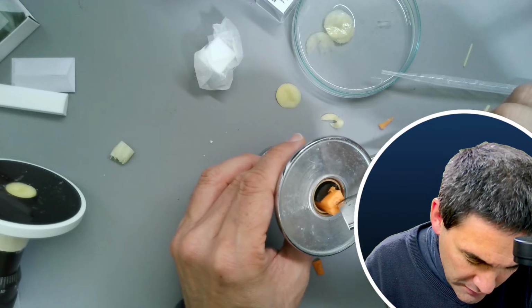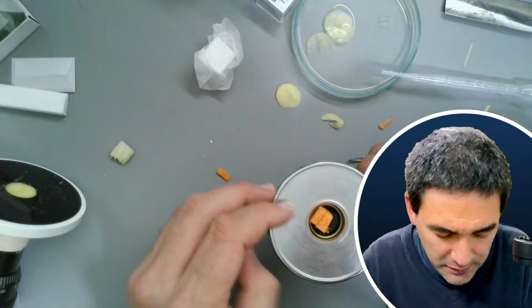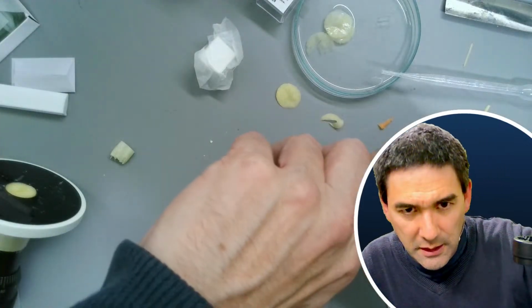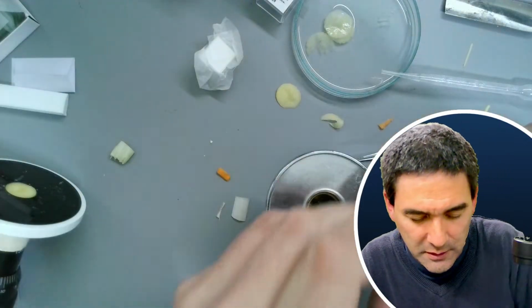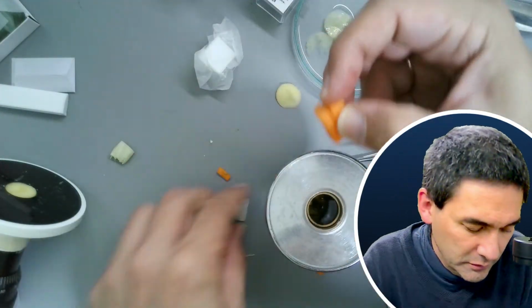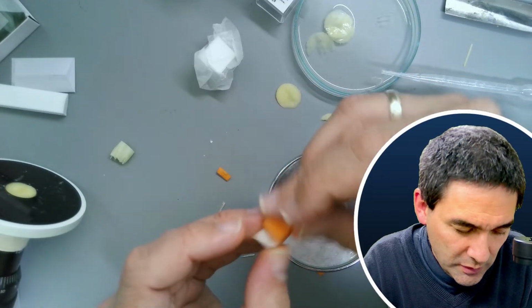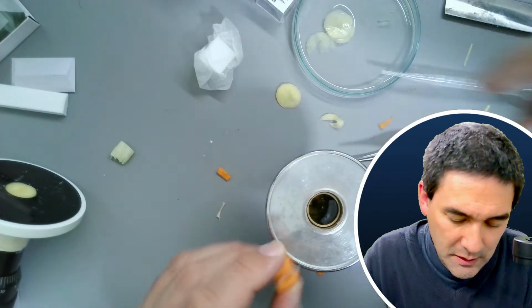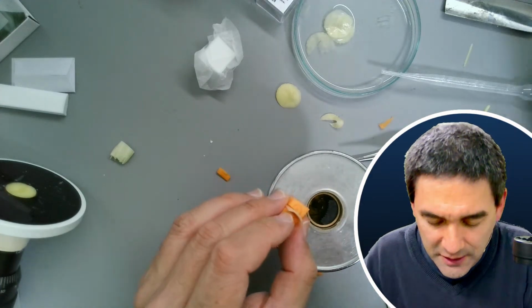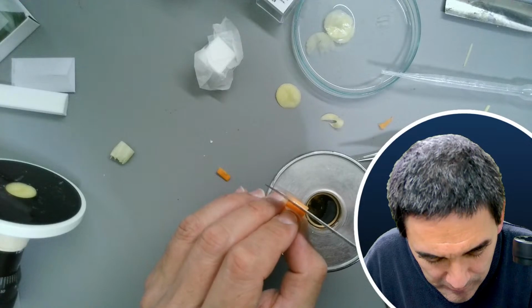I cannot believe this. Actually, did I pull it out? I think I pulled it out. Can this be possible? So here we have some demonstration problems. It's gone. Here it is. So let's try it again. I'm going to cut the side here to make it easier to be clamped down.